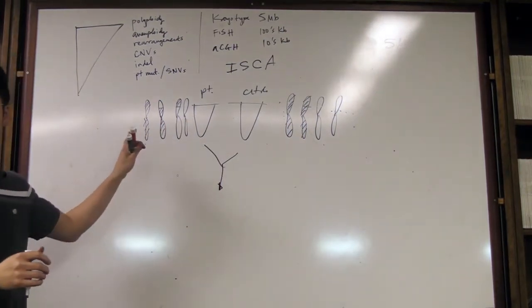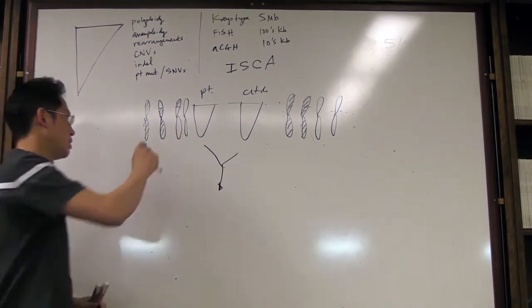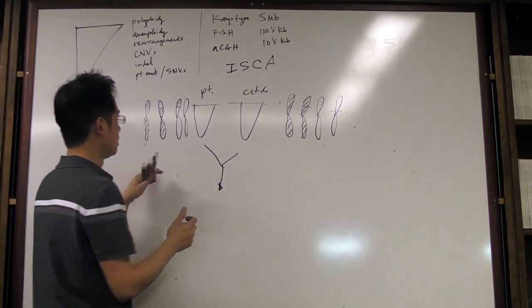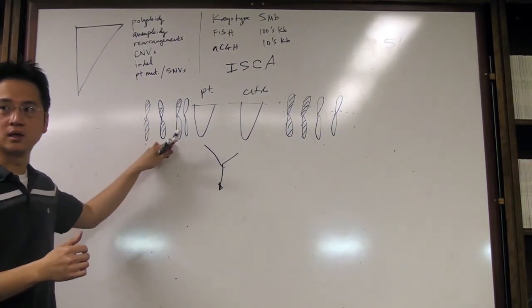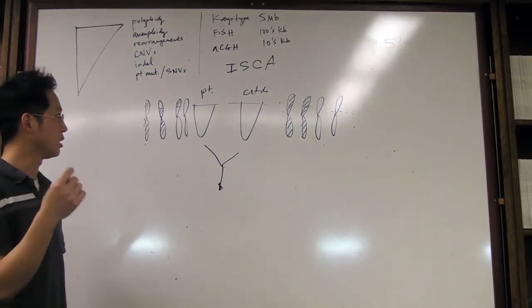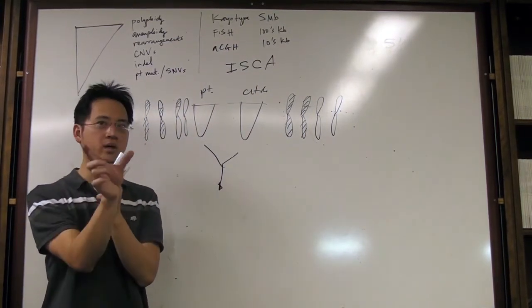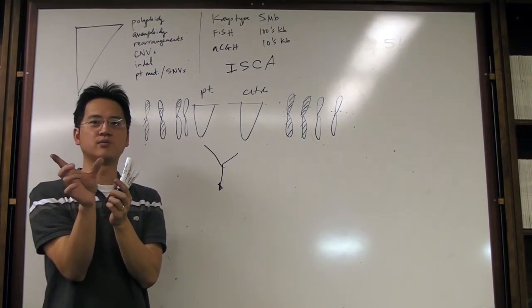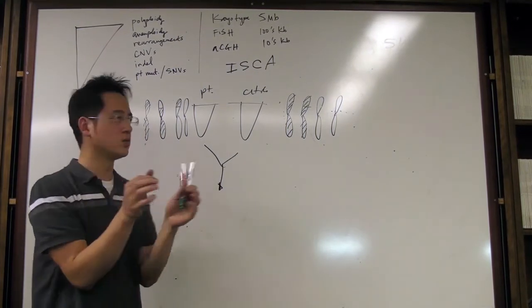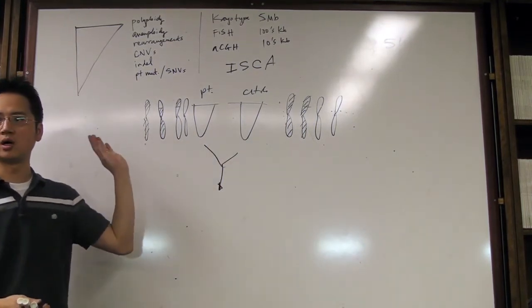Two situations. Patient has a balanced translocation, a rearrangement that's interchromosomal. Nothing happens at this breakpoint. It's a clean cut switching of the 2 arms. You incubated 1 microgram of this DNA. You incubated 1 microgram of this DNA. You go do the labeling. Yes, at the molecular level, maybe that junction is covered a little bit differently by 100 bases of that one fragment of DNA that is produced during the labeling, but you're not going to be able to distinguish that on array. So when you mix the 2 samples together and you hybridize, there's really no dosage differences between the 2.